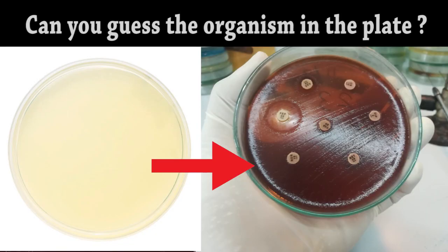Can you guess the organism in the plate? I will give 30 seconds to think of the correct answer.